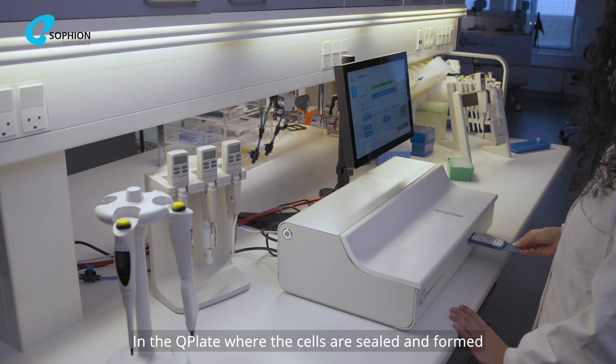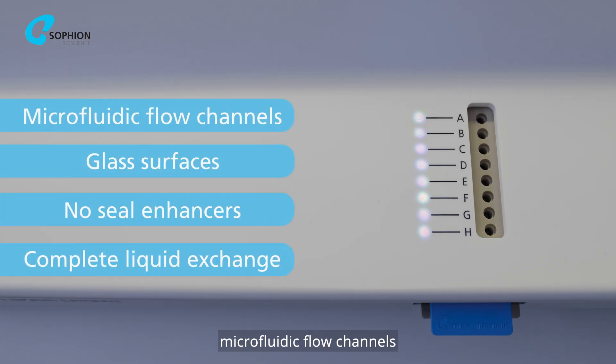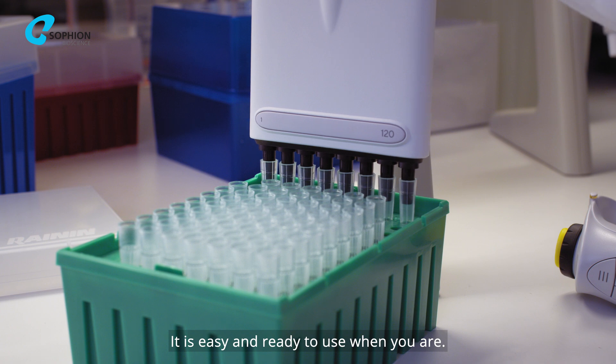In the Q-Plate, where the cells are sealed and formed into whole cells, microfluidic flow channels and glass surfaces ensure good liquid handling. It is easy and ready to use when you are.